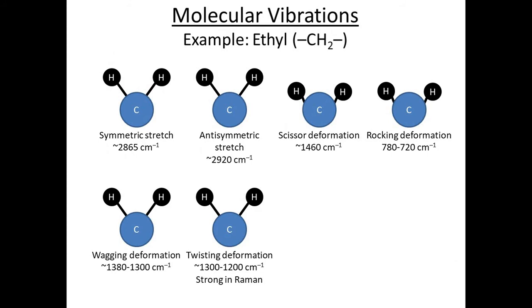And those multiple atoms are connected to each other. Because they're connected to each other, mechanical vibrations can get translated through the molecular structure to each other and cause what is known as mechanical coupling. And so you can get cooperative motion of these atoms.